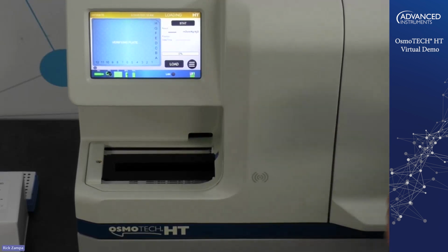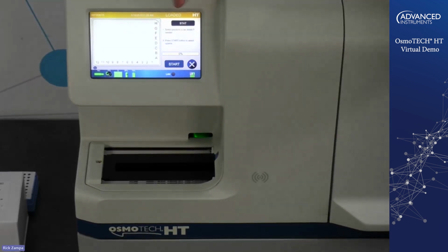It's verifying the plate, checking to see if any positions have been used. You can see it says loading here. You can see the plate hasn't been used before. You can see the date and the time at the top here. This instrument has also been named. You have the option to name it whatever you want.